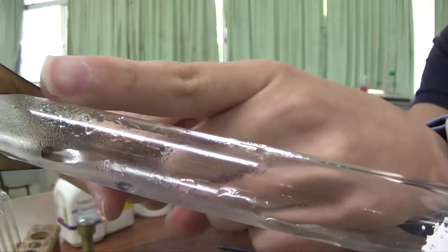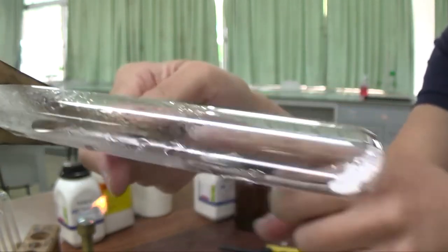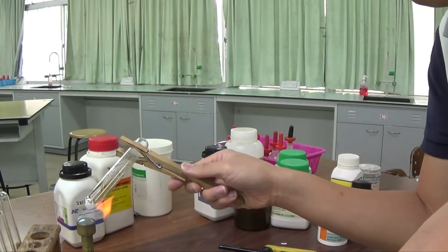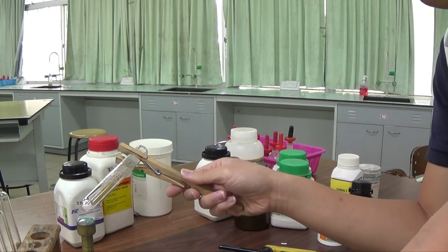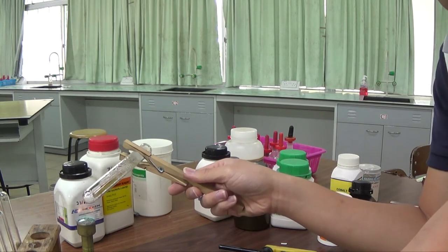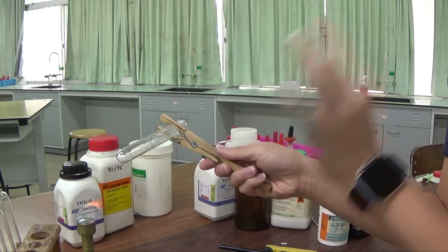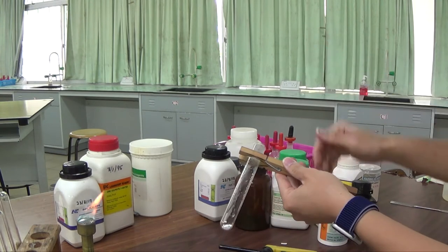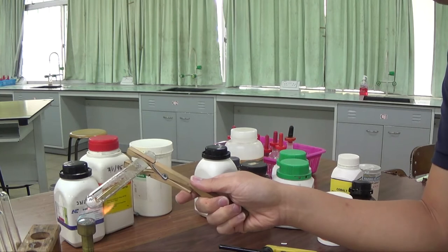I started out with a dry test tube just now. I get a colorless liquid that forms on the upper part of the tube. When you heat a white solid, or any solid, and you get a colorless liquid forming on the upper part of the tube, you should be thinking there is water of crystallization, okay? Because this colorless liquid is most likely water, which of course you can test with a good cobalt chloride paper, which should be blue in color, and it will turn pink in the presence of water.